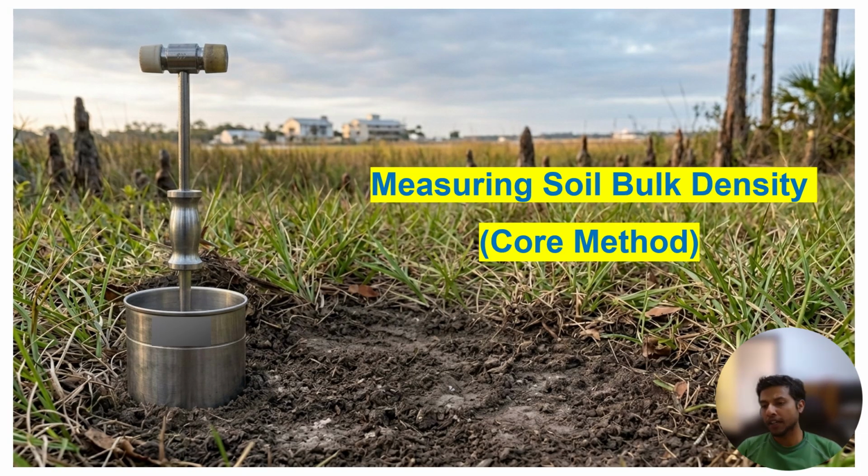Today I'll be explaining and walking you through the core method for measuring bulk density. This is a critical field and laboratory procedure used by scientists to assess soil physical properties, pore spaces, and the overall level of compaction at a given site.